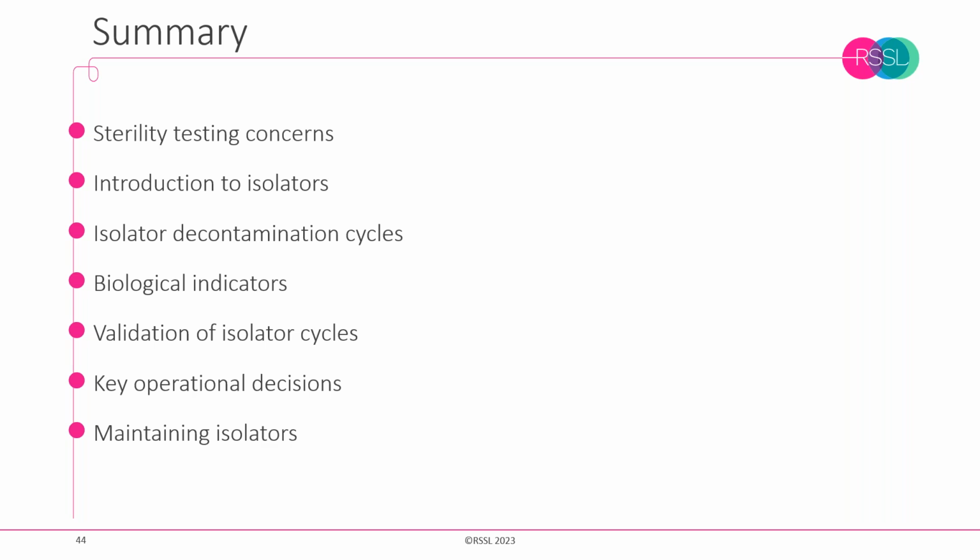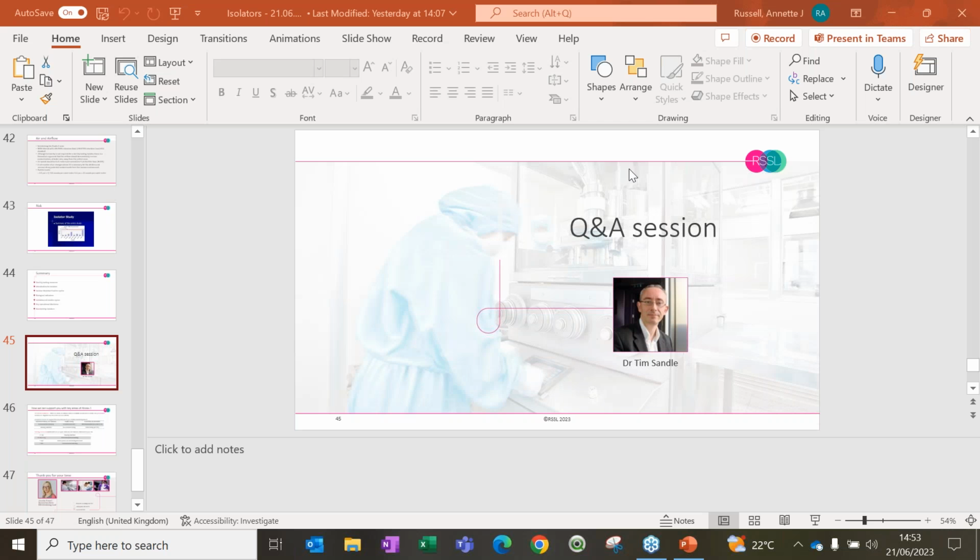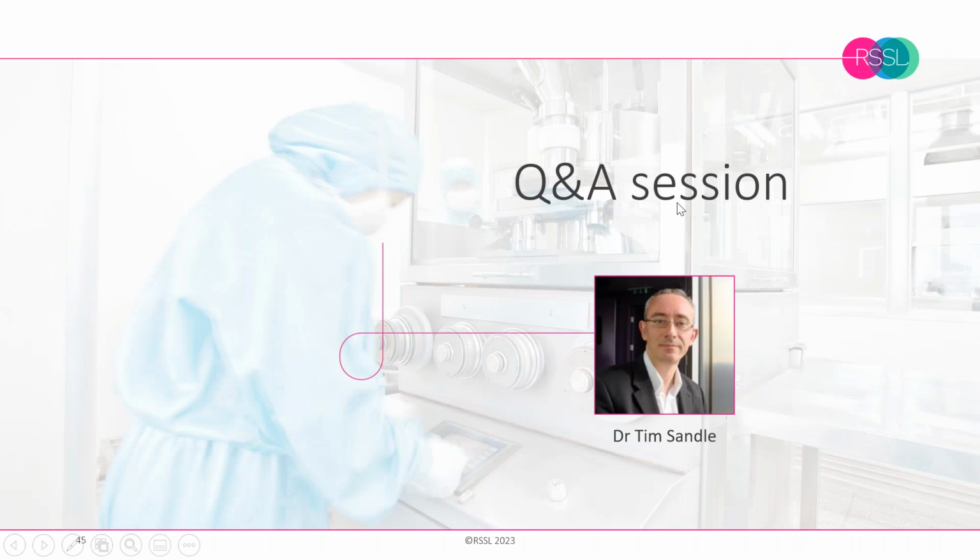Thank you, Tim. Just while we swap over, we've had quite a few questions come in. So I'll put my screen back on, and there we go. So the first one I have is from Nasir, and he said, for a lab isolator in a microbiology lab, do you need to perform a smoke study?